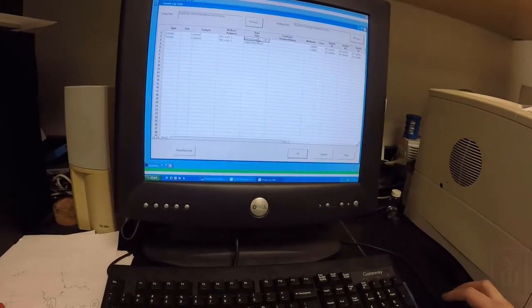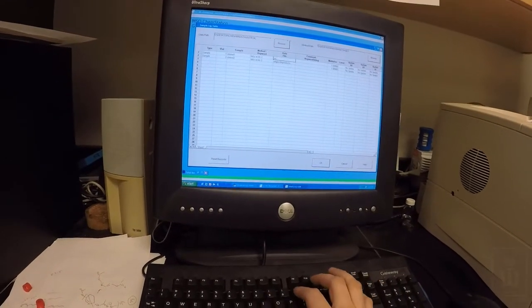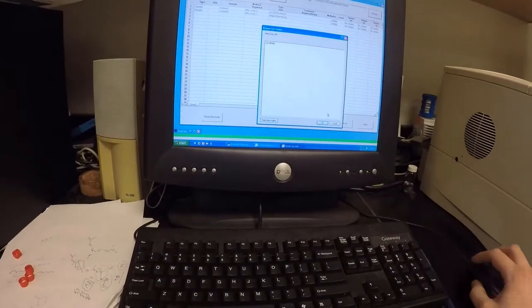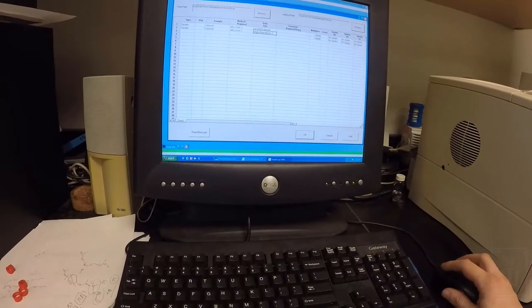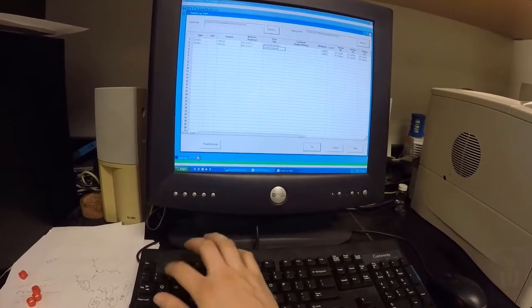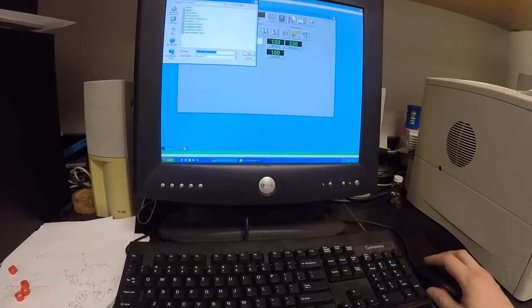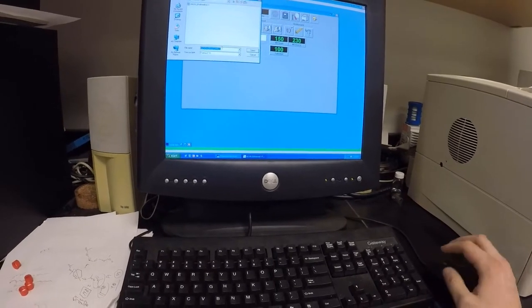The data file is what the name of the file is in the program. The data file is what you name it. So I might say JM22618 olive oil 1. That's a nice way to do it. And it's going to go into the olive oil folder. Then I'll do the same thing, JM22618 olive oil 2. Nothing else needs to change, just hit OK. And I'll also save that sequence. So up to sequence, save sequence as, back on the desktop, CHEM 408 sequence tables, and I'll say JM olive oil.